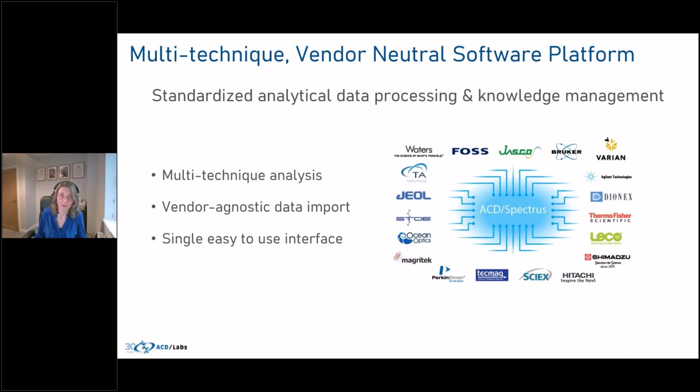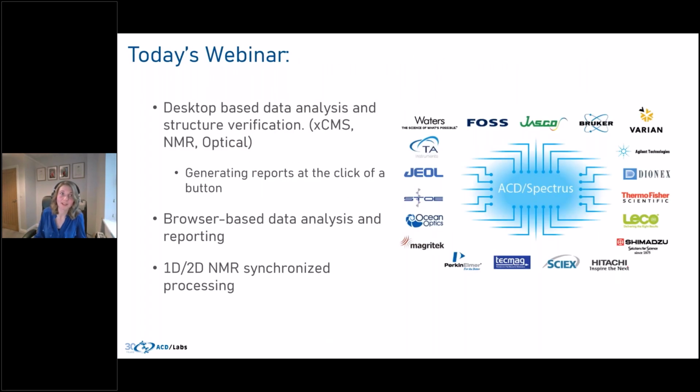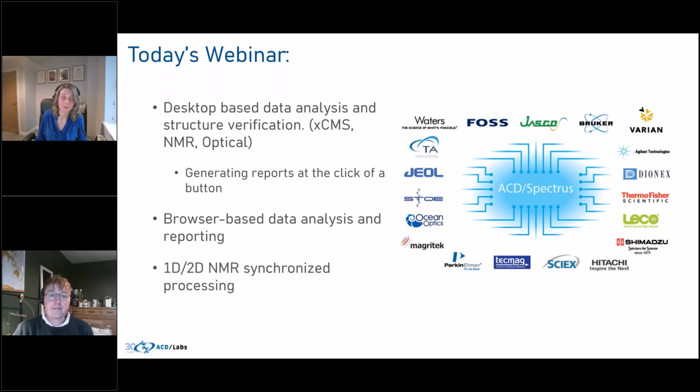So without further ado, today's webinar is looking at the desktop application of Spectrus Processor as well as Spectrus Processor JS, which is our browser-based data analysis. And once again, our presenter today is Tom, who's our application scientist based in the UK. So Tom, over to you once again. Thanks, Bara.